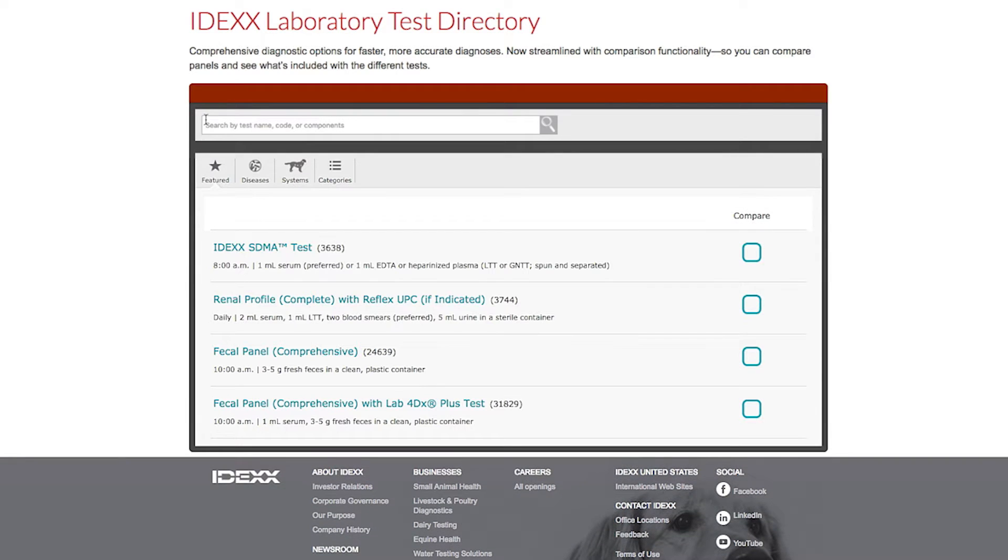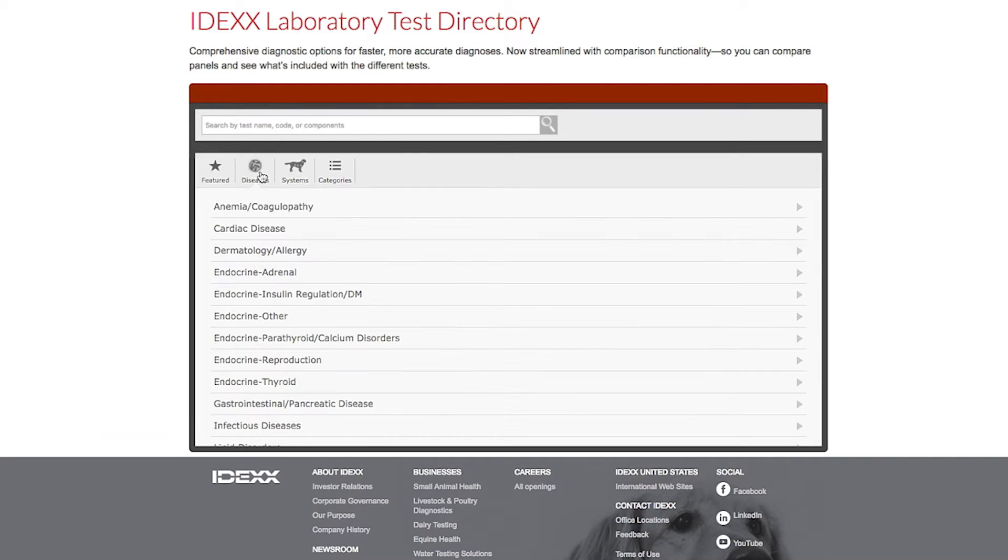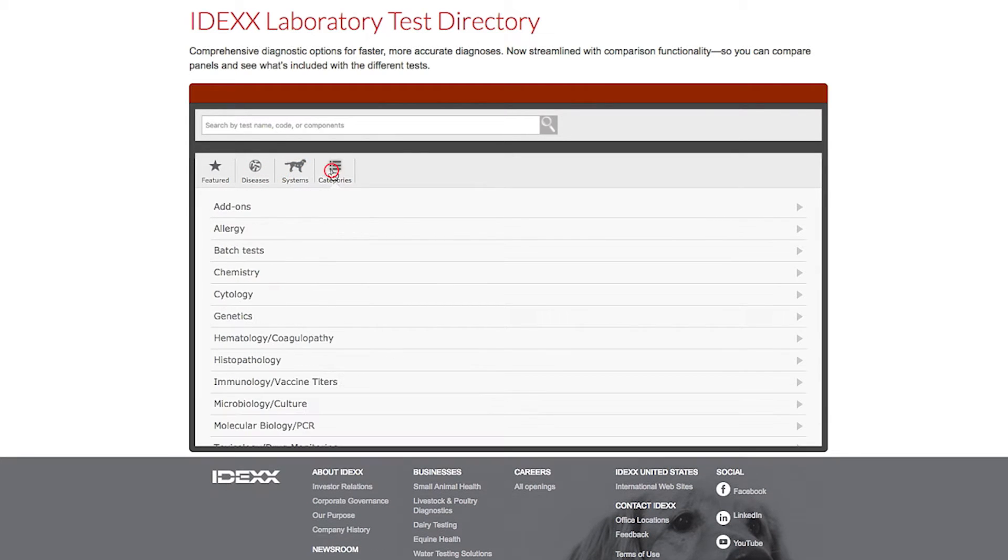Tests are also organized by category. The featured category showcases the newest IDEXX tests. You can also find tests by disease or body system, and categories list tests by methodology, such as chemistry or microbiology.